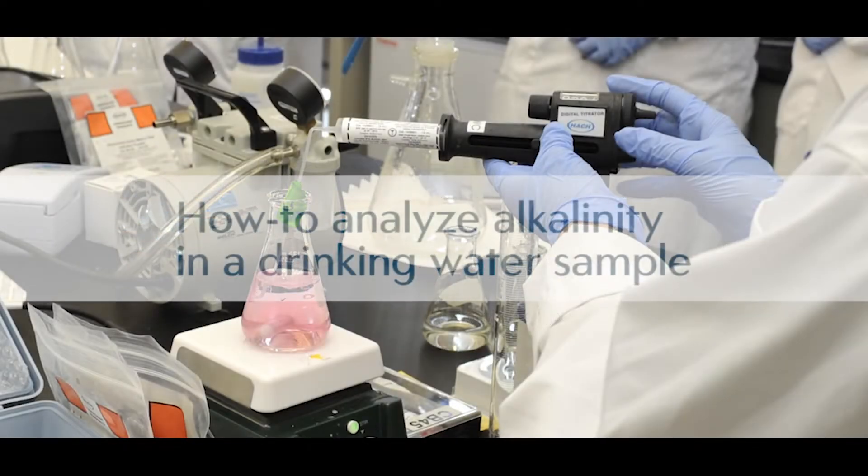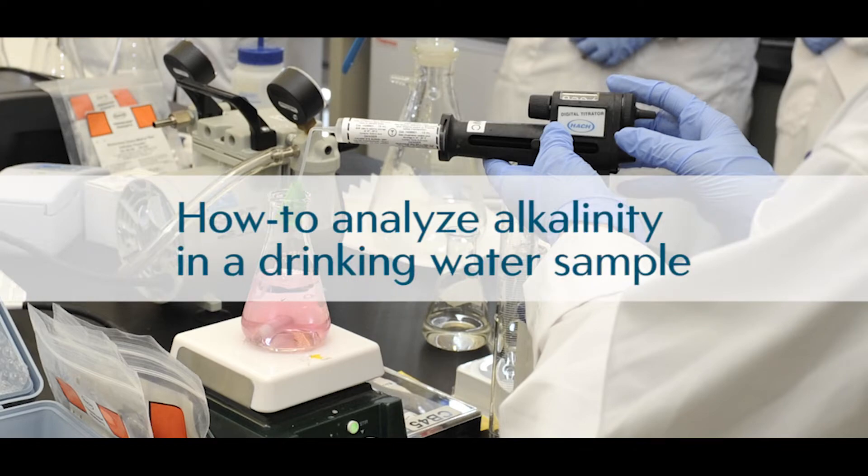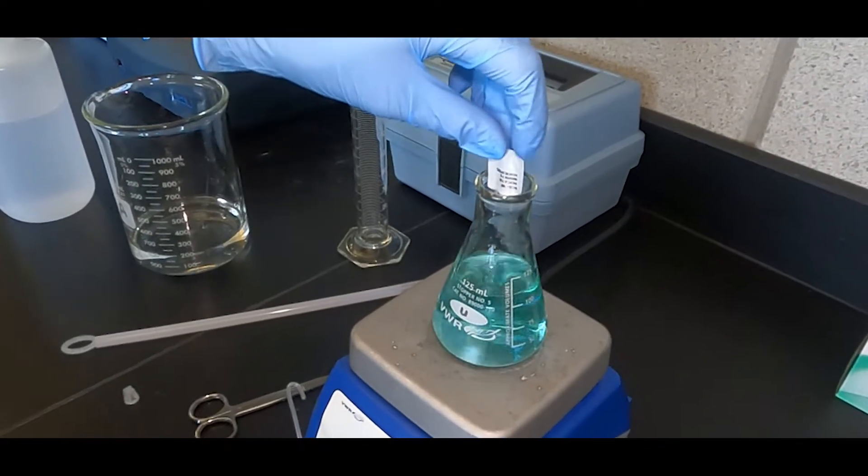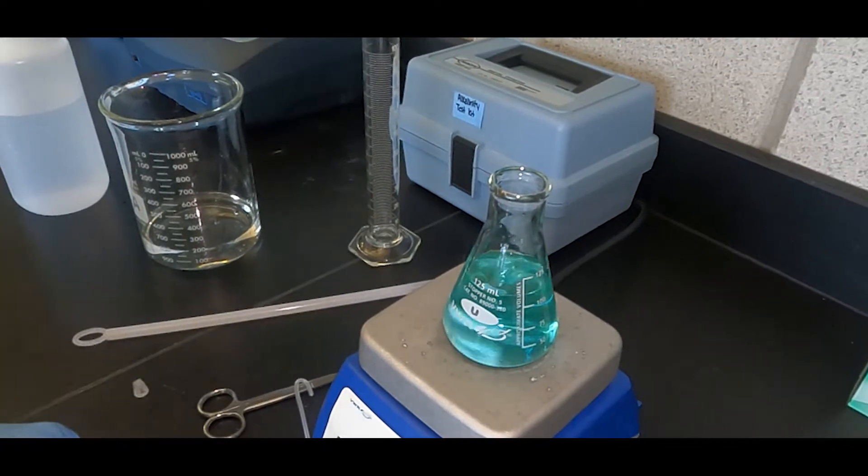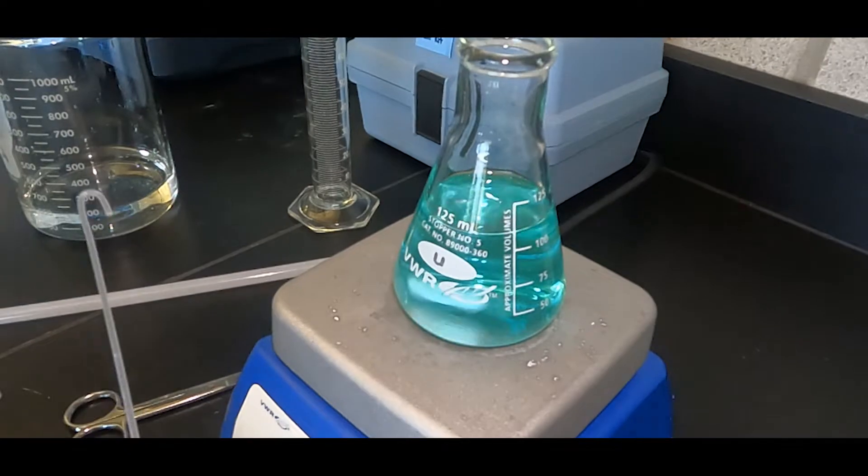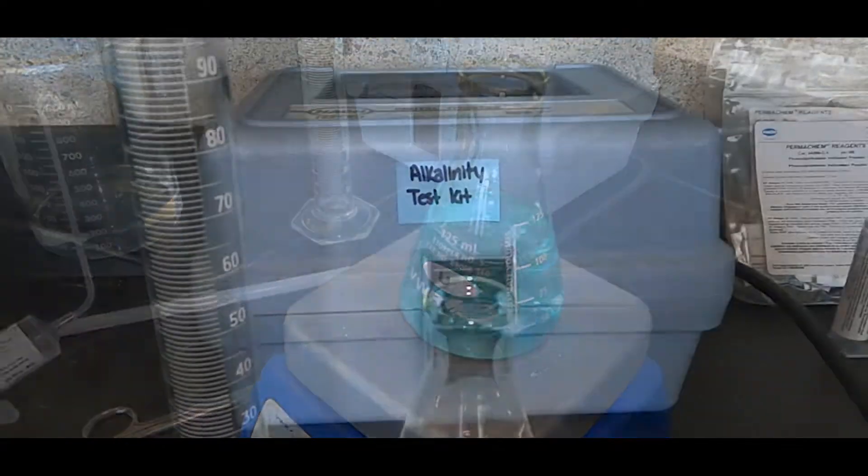Alkalinity is a water's buffering capacity or its ability to resist change in pH. This procedure involves titrating a water sample using sulfuric acid solution to an endpoint determined with color indicators or a pH meter.